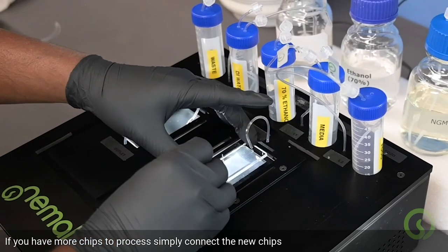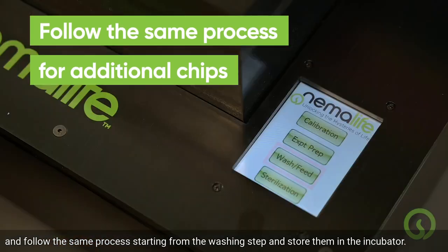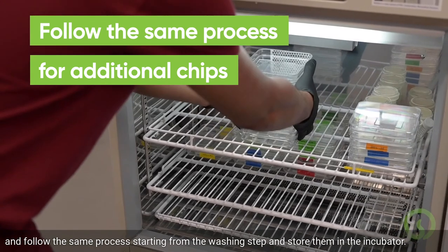If you have more chips to process, simply connect the new chips and follow the same process, starting from the washing step, and store them in the incubator.